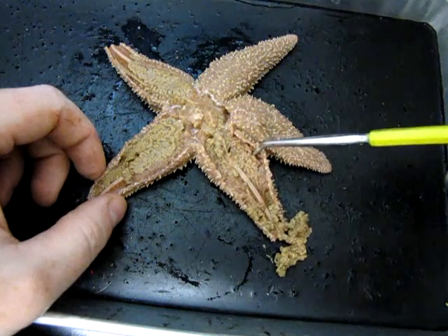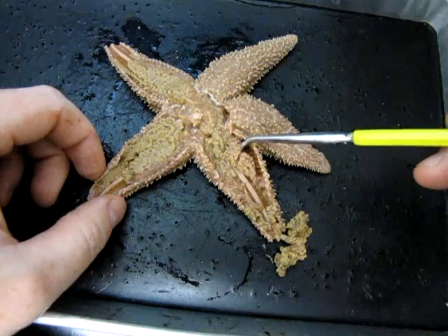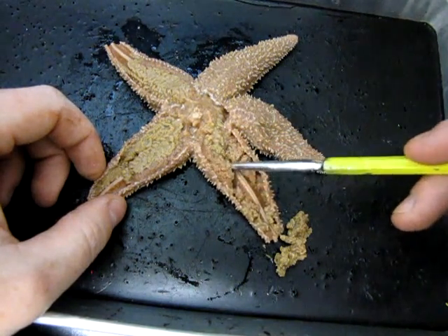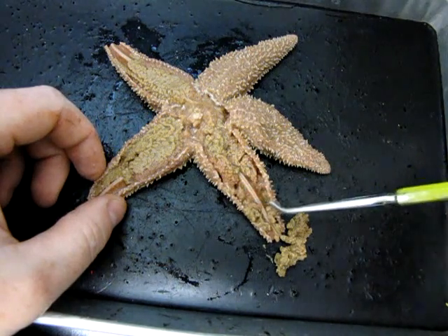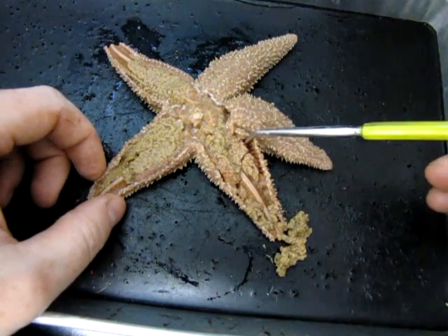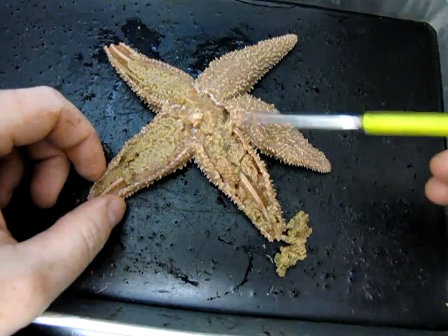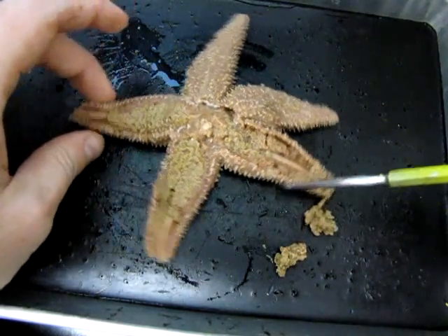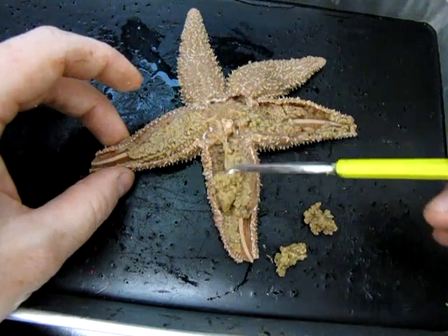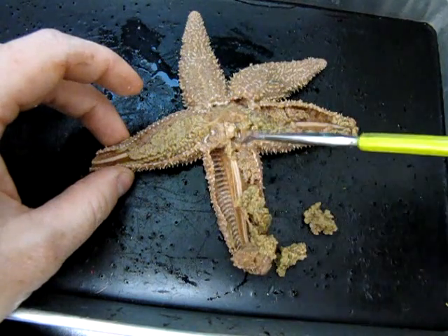You'll notice that the color and texture have changed slightly. These little roundish structures beneath here — on both sides — are called gonads. The gonads are obviously involved in reproduction; that's where the sex cells are produced. I'm now going to remove both the gonads and the pyloric caeca from this arm so we can see what's underneath.